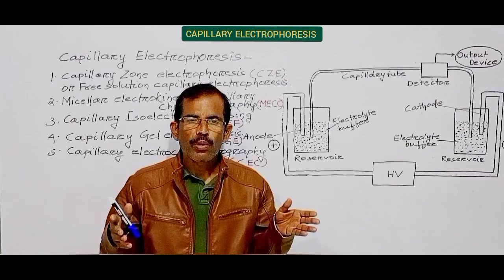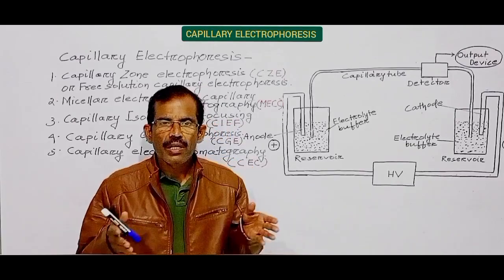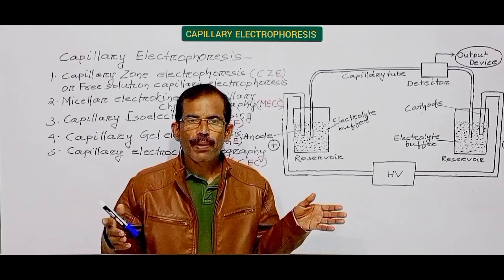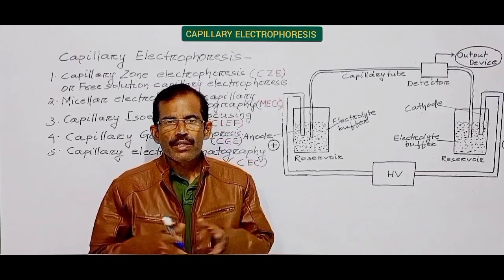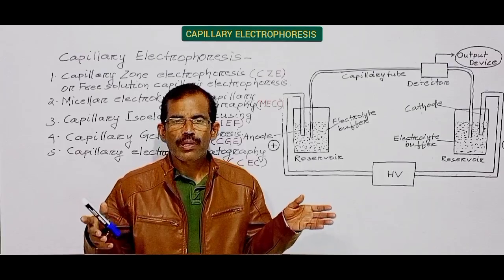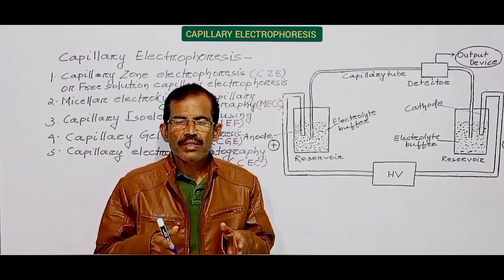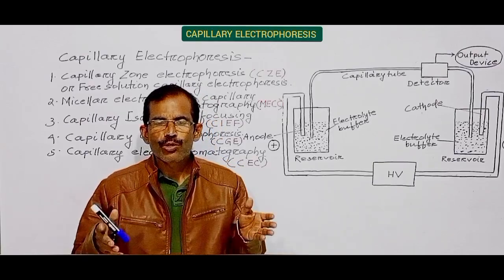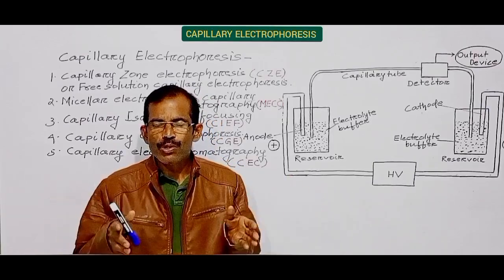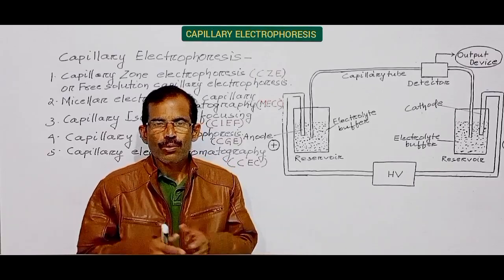The most popular capillary material used is fused silica that is transparent to the UV and visible light. The tube can be externally coated with a polyimide material to increase the flexibility. Finally, the capillary tube is enclosed in a thermostatically controlled environment for temperature control.